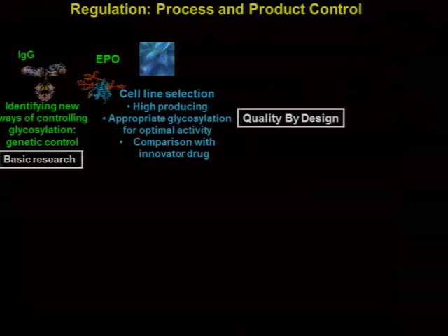And there are, of course, many reasons to do glycan analysis. This is the slide I showed yesterday. You may want to do fundamental research to understand the genetics that control IgG glycosylation, for example, in which case you'll definitely need a detailed glycan analysis.